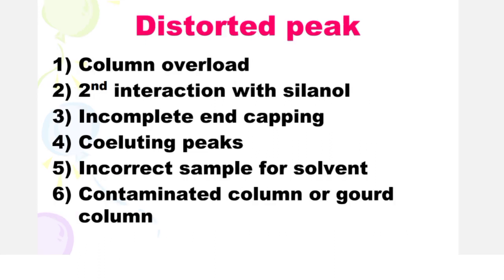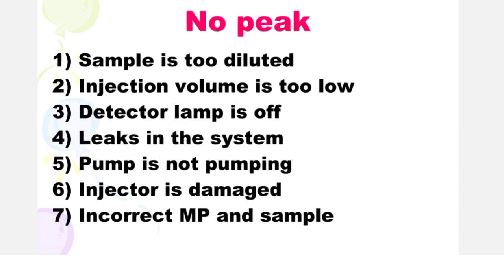Next is distorted peak. Distorted peak is due to when the column is overloaded, secondary interaction with silanol, incomplete end-capping, co-eluting peaks, incorrect sample solvent, and contaminated column or guard column.